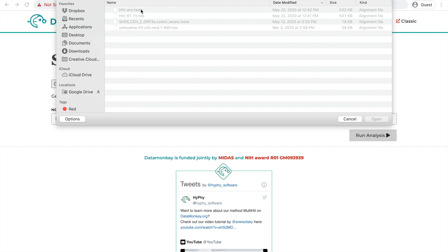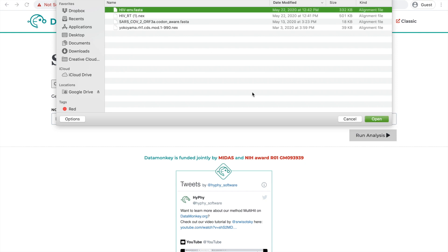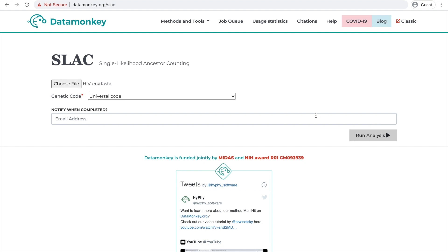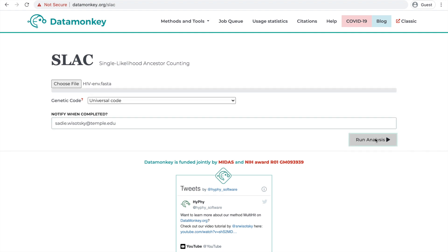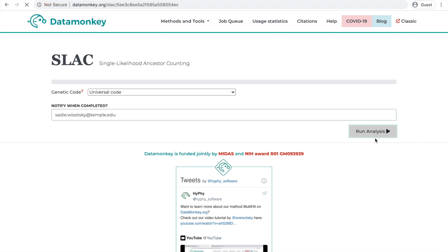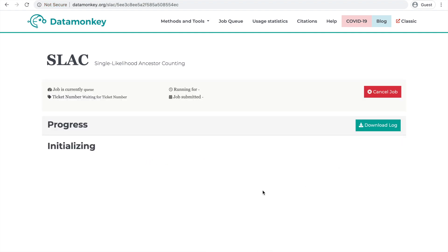So today we're going to be using this HIV envelope dataset because we know that selection has acted upon it. Then we're just going to hit Run Analysis, and your SLAC analysis will start running in this tab.